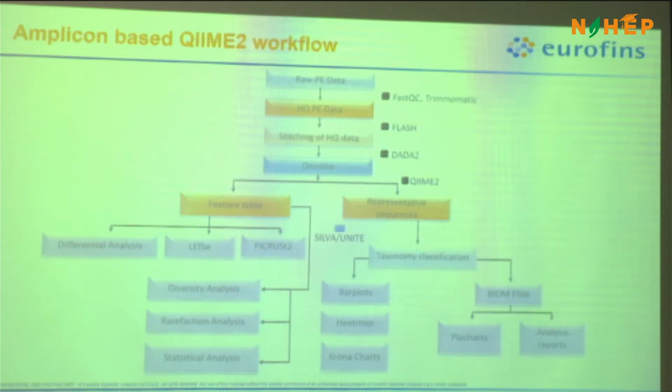So as Dr. Kumar already told, you people have done a set of analyses, so it will be a repeat or it might enhance a few points. Now in 16S, QIIME1 was used earlier. Now it has changed and we are using QIIME2.